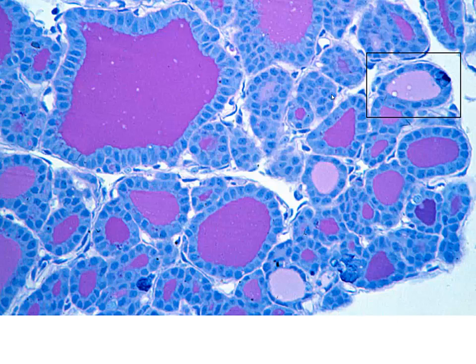But then at these higher magnifications, you can clearly see our principal cells surrounding a thyroid follicle. You can see these all very regularly arranged. We have our colloid material on the inside. And then as we look at some, we're going to see these extra cells, very dark staining. They're going to interrupt the pattern of our follicular cells on the outside. Here we see some, and in this one, I think we're going to look a little more closely. We see the interruption of these cells. These are the parafollicular, or the C cells, that are present surrounding our follicles.